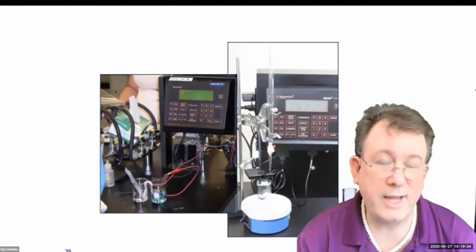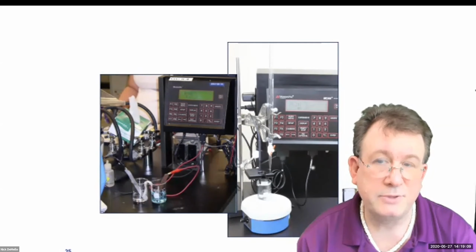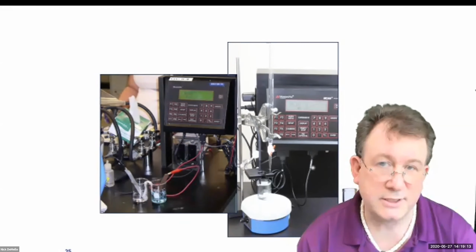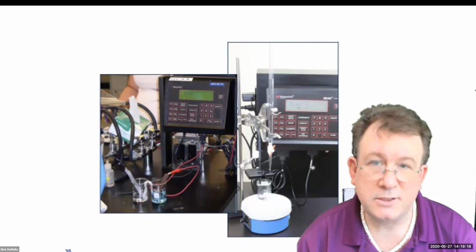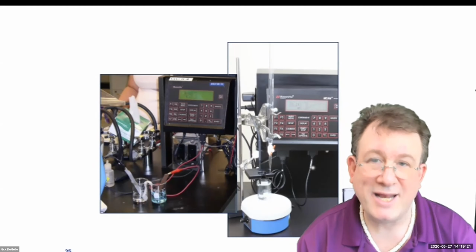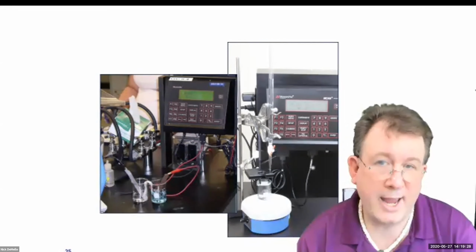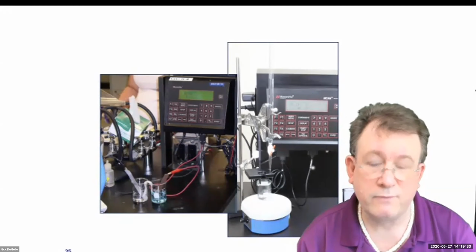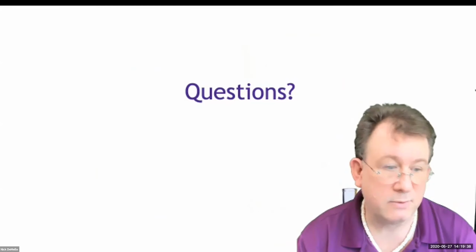Now, we have the advantage that our labs are already wired with instruments for capturing data with various probes: temperature probes, pH probes, drop counters, etc. And we have the ability to put this data up on the internet, which means students can participate in the lab and capture their own data as you are walking through the experiment. We could also do this with HyFlex groups, where half the students are there in person and half are there virtually, and alternate as we go forward. But this is a fourth piece that we're exploring. We're just getting started with it.